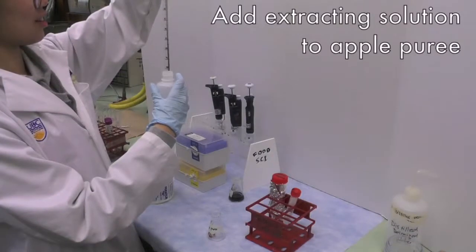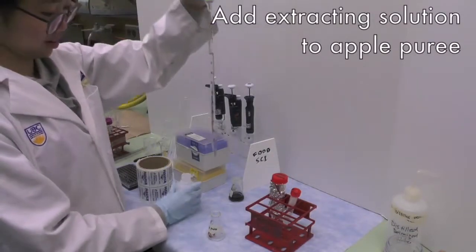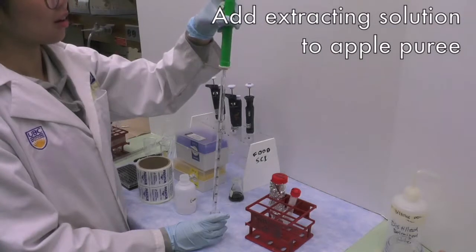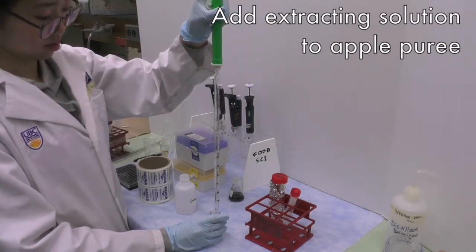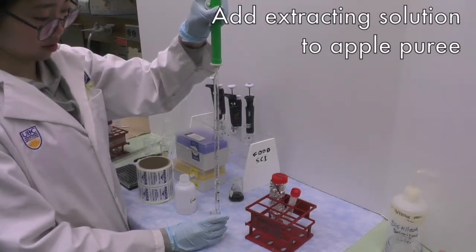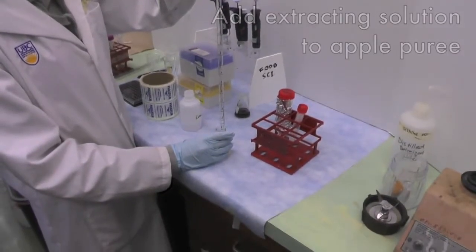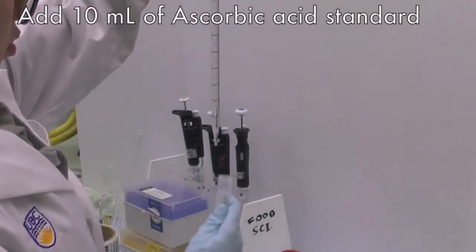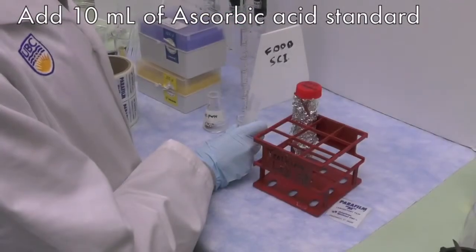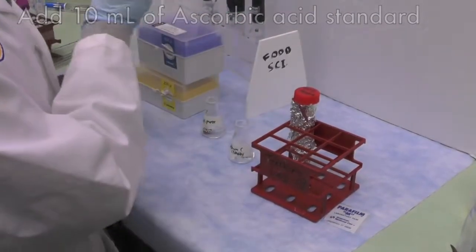Weigh 1.00 gram of apple puree into a 25 ml Erlenmeyer flask and add 9.00 ml of extracting solution. Repeat this for all puree samples, including D-value samples. Prepare 10.00 ml of ascorbic acid into a 25 ml Erlenmeyer flask.